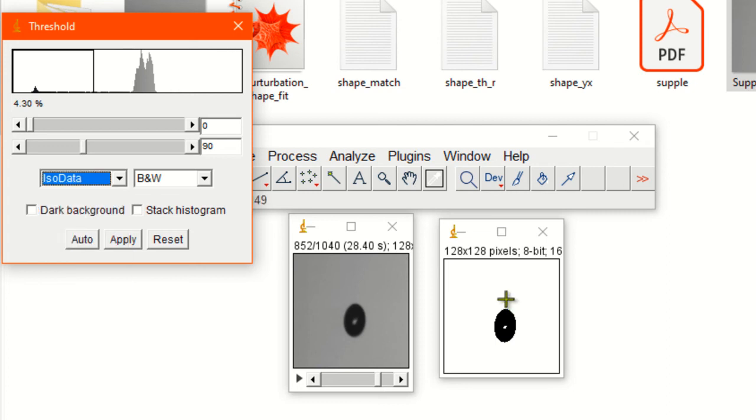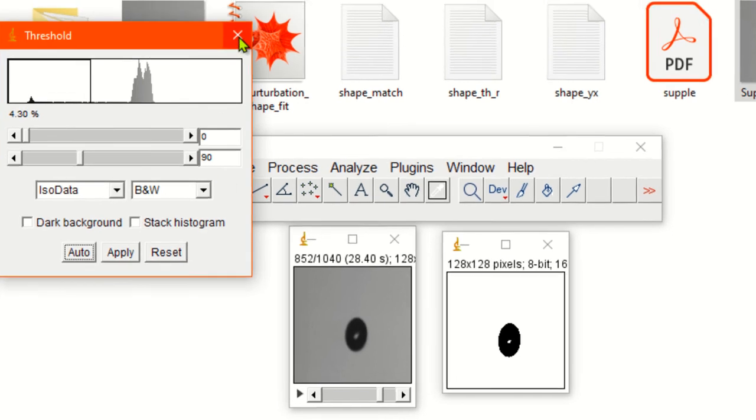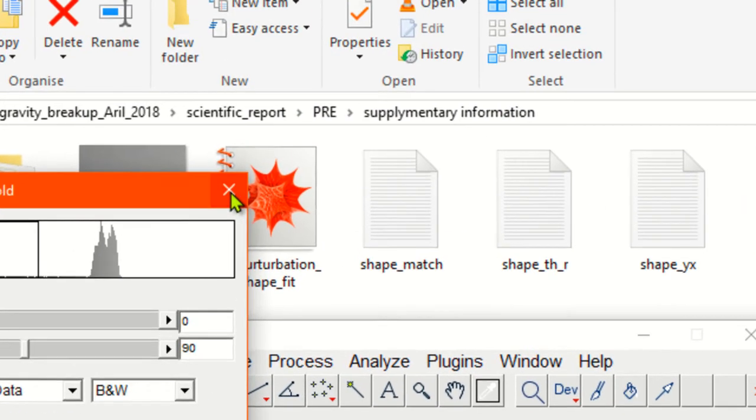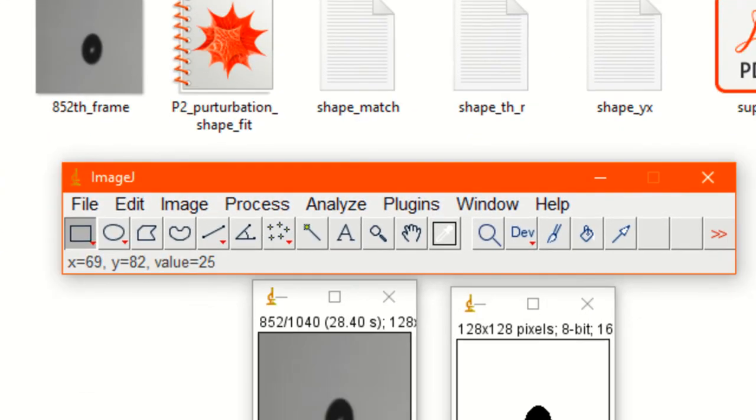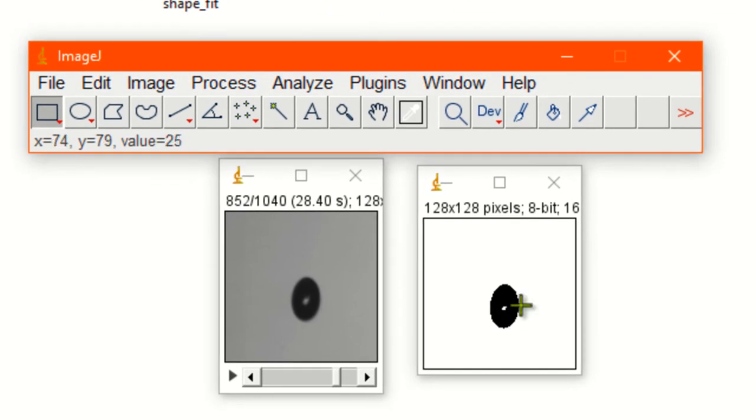I'm choosing isodata. Just click auto. Now close this window. Again you find a hole at the center. Now we want to fill the hole.